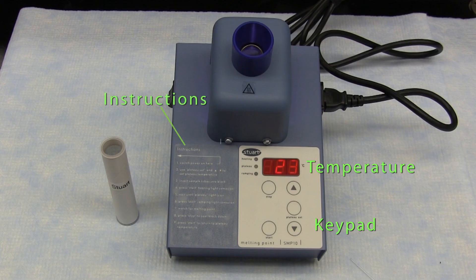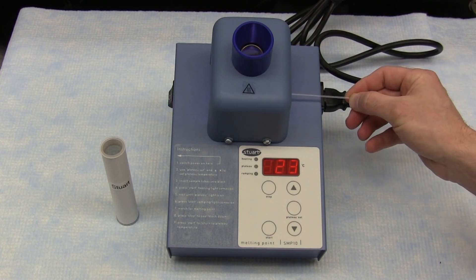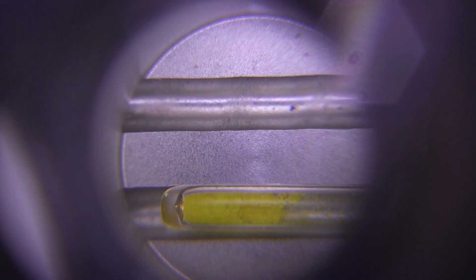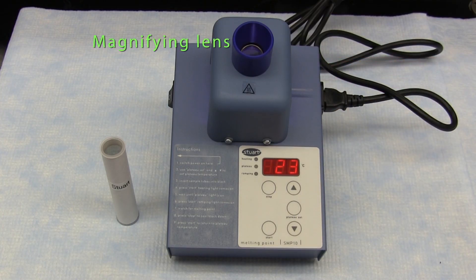Easy to follow instructions are printed directly on the instrument. The SMP10 is designed to give both quick and accurate results and is easy to use. Melting point samples are placed in a glass capillary tube, which is placed in the aluminum block inside the sample chamber. The block is heated and the sample observed through the magnifying lens until melting occurs. The temperature may then be easily read from the LED display.